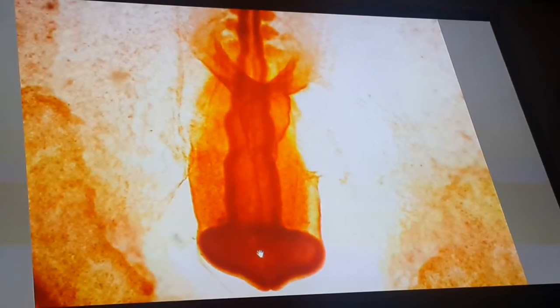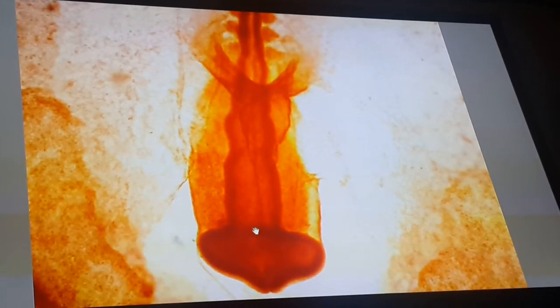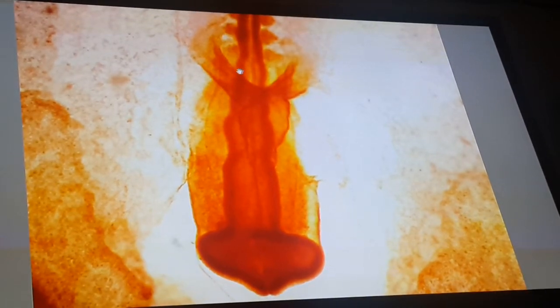And also you can see the neural tube showing the optic vesicle. This is the telencephalon and the optic vesicle. Just look at the opening of the neural tube anteriorly. This is the neural pore, the anterior neuropore. So anterior neuropore, telencephalon or forebrain, optic vesicles, diencephalon, mesencephalon, metencephalon, and these are the curves or crescents of rhombomeres of the myelencephalon. Just look at the notochord, how it appears overlapped by the structure of the neural tube. This is the notochord, and these are the somites. But our subject is the heart tube.